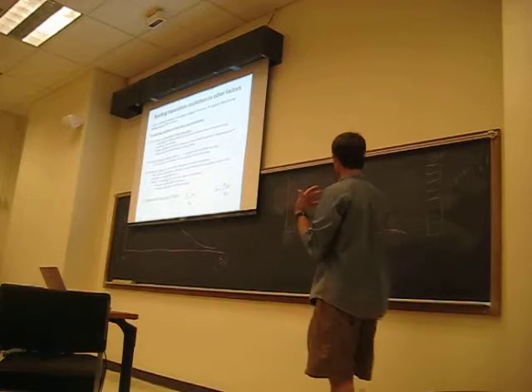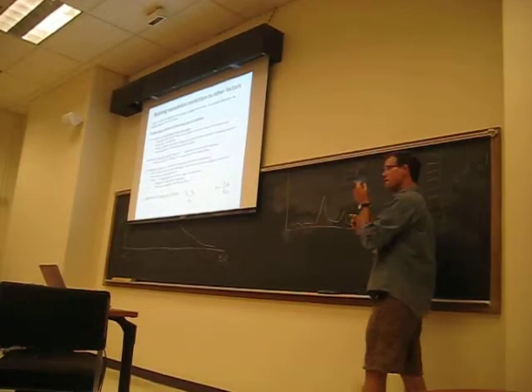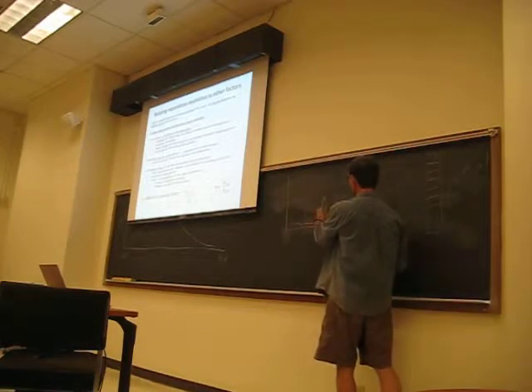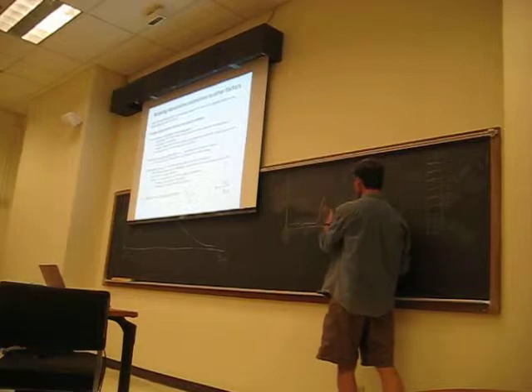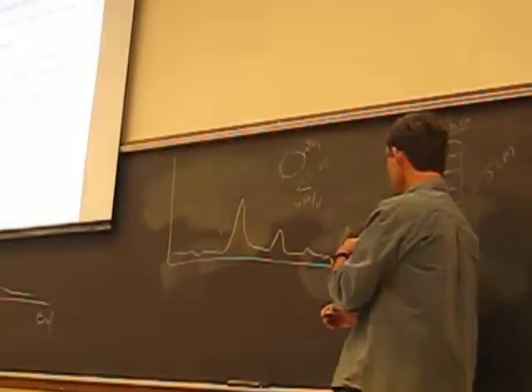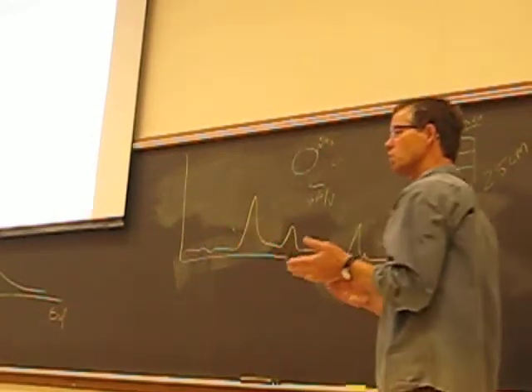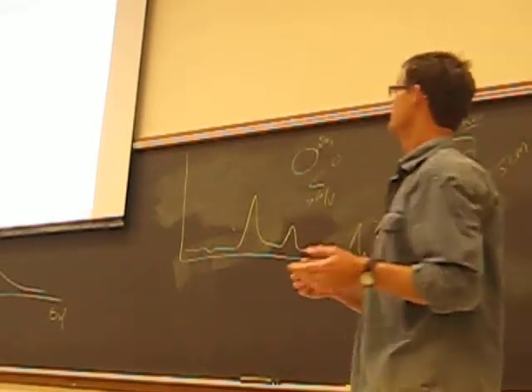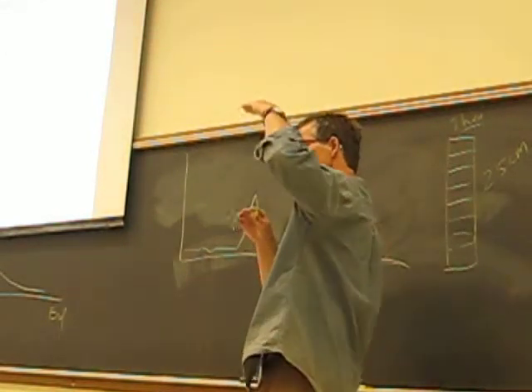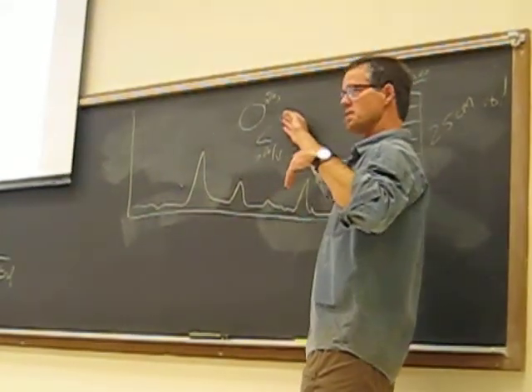So if we back up: this is theoretical, this is reality, and I know that my goal as an analyst is to optimize separation of analytes in the shortest amount of time, and I have several things under my control to achieve that. One of those is to increase the number of theoretical plates in my column, which is the surface by which things can partition.